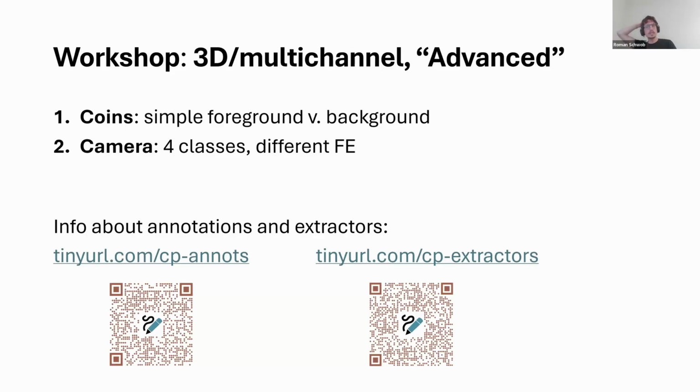If it's proper 3D imaging data, you could also treat different two dimensions as the planes. Does that make sense? We're about to implement this as well. But at the moment, it's only processed as a stack of 2D data.